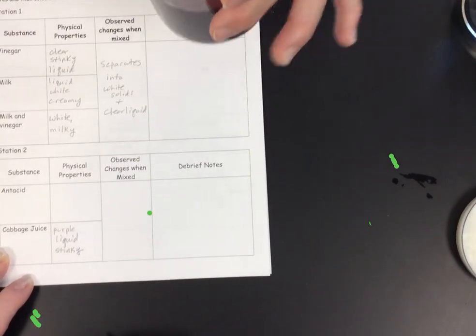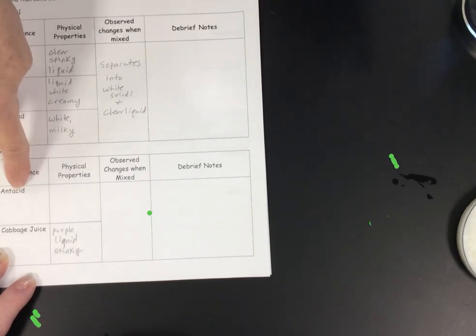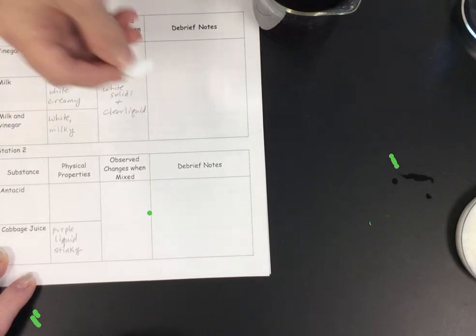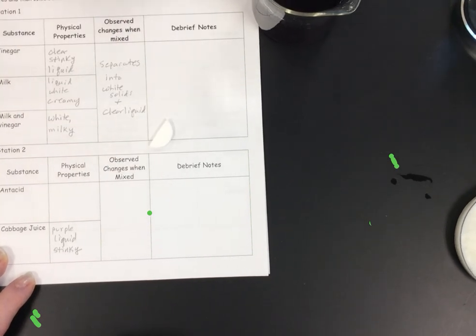And if you don't know what an antacid is, it's a medicine that is supposed to make your tummy feel better. Alka-Seltzer is the main brand, and this Alka-Seltzer is what we use here. It's just half of a tablet.